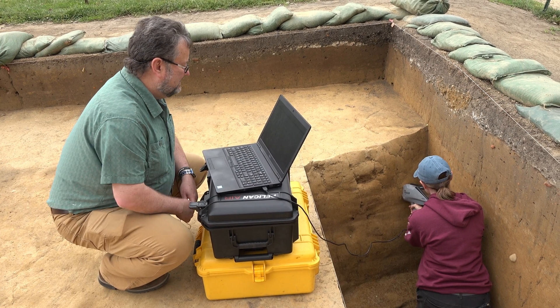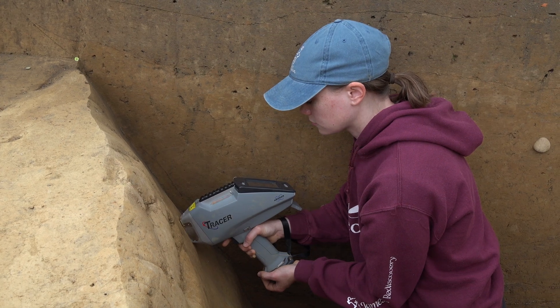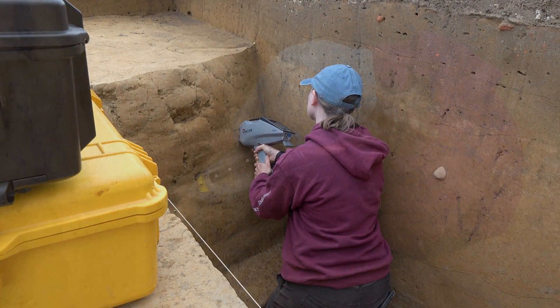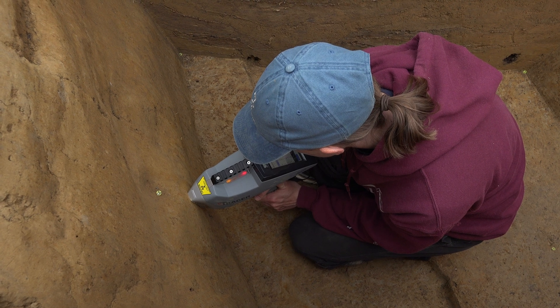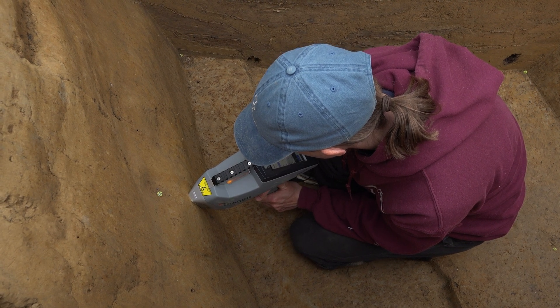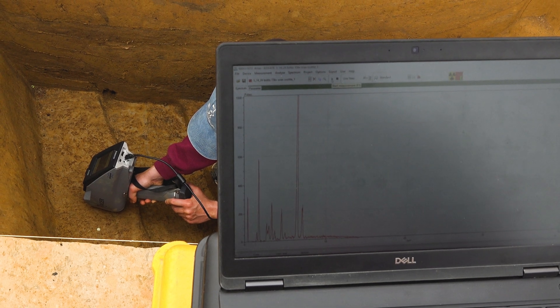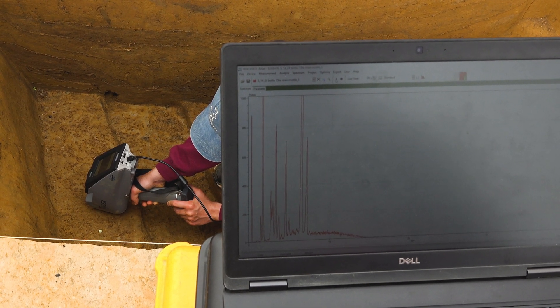Here's what we use — this is a portable X-ray fluorescence unit. This shoots a series of photons out of the nose here into an object. It excites the electrons; they release photons themselves that come back into the detector, and they're specific to each element, so we can determine every element in whatever we're looking at. Using this machine, we're targeting the three different sections of subsoil I noticed outside the ditch feature: up top where it's solid orange, underneath where it's both orange and that mottled silvery yellow, and then at the very bottom where you have the orange, the silver yellow, and that sprinkling of dark brown.